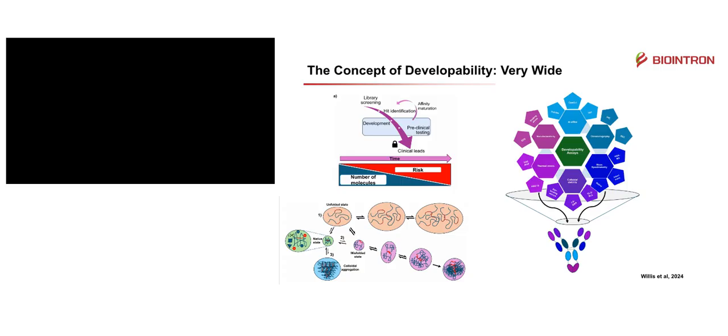So when we are working on a large molecule, it has a native state, but it can go to other states, such as unfolded states, misfolded states, and aggregated states. So developability is a group of methods to evaluate the stability of the molecule, especially in a formulation setting and also in vivo.